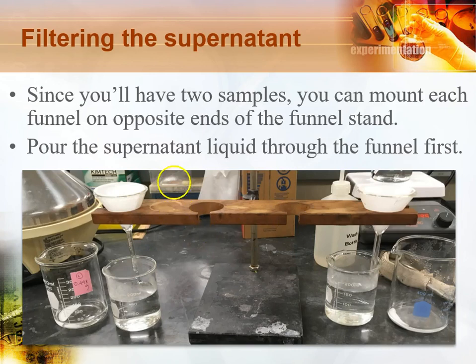I also have, I don't know if you can see this in my lab bench with all of the other things that I have here, these wooden funnel setups where you could actually do 4 samples at a time. We're going to ask you to do 2, but you could do 4 at a time if you wanted to. So I did 2 samples.